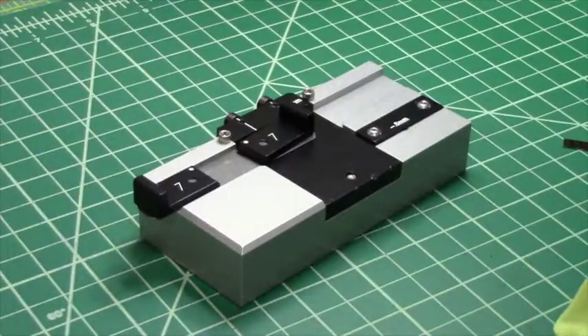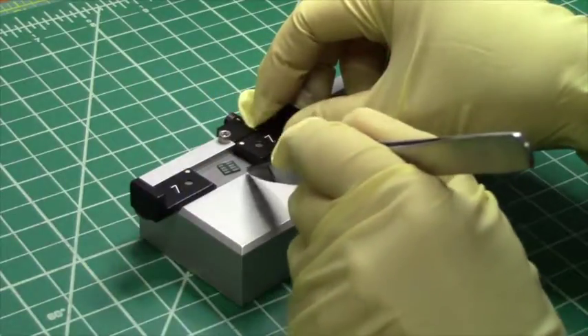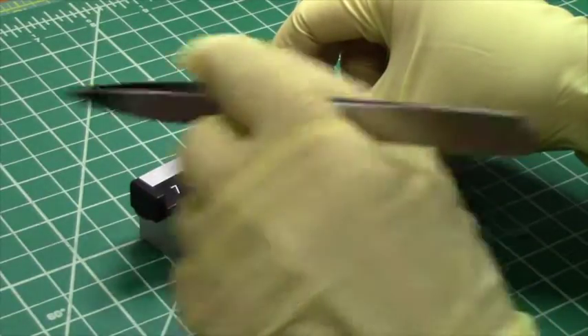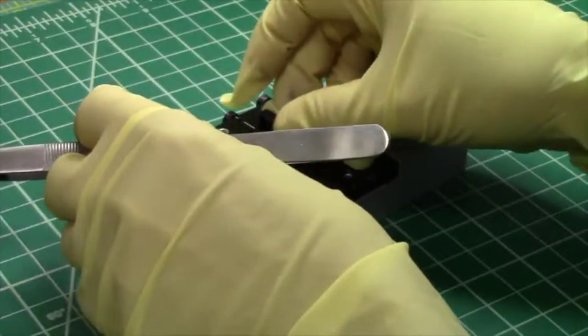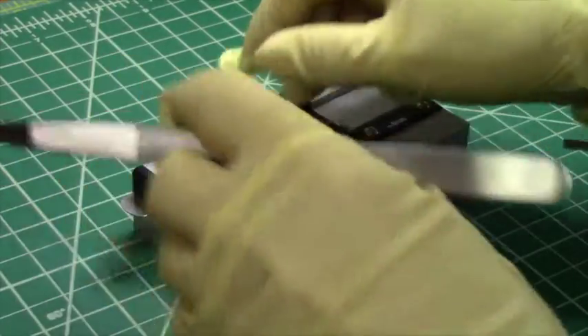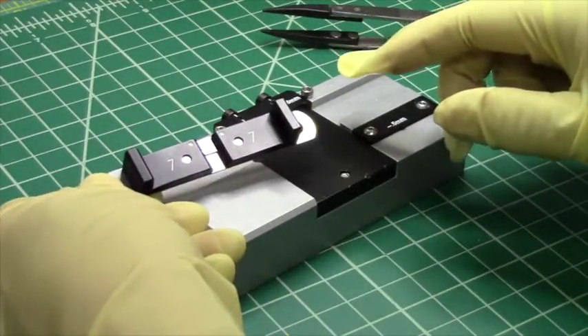To cleave a sample using the small sample cleaver, you first want to load the sample into the hold down so that it can be accurately cleaved. In this case I'm using the 700 micron jaws, and you can see it fits in the holder.